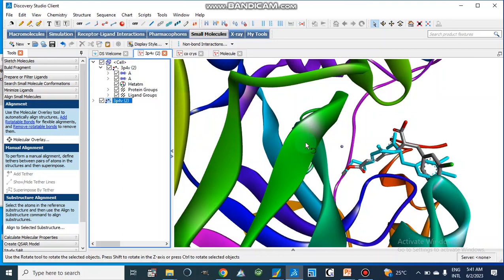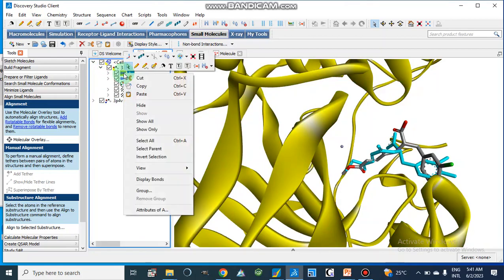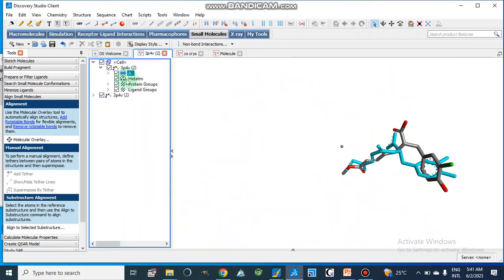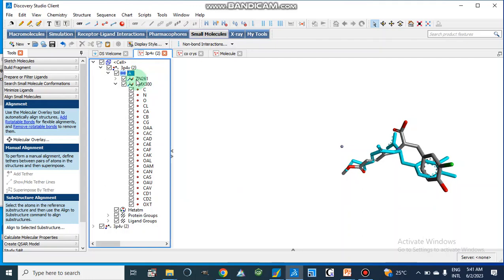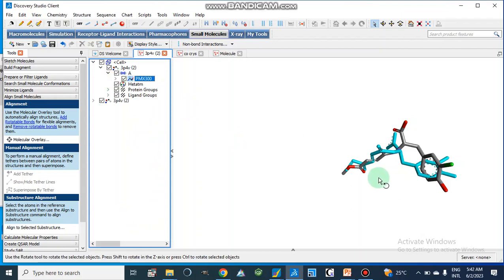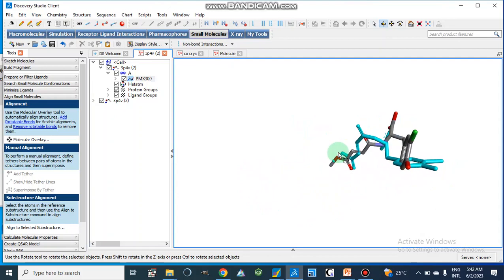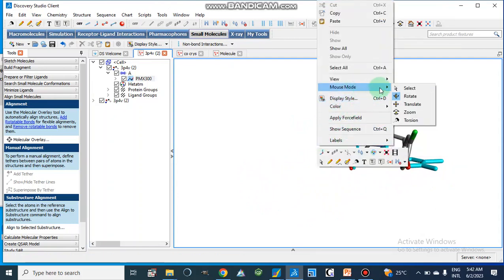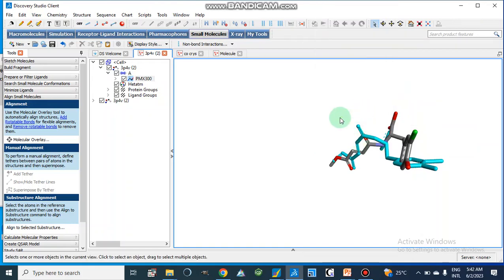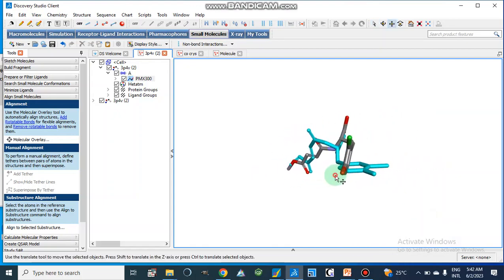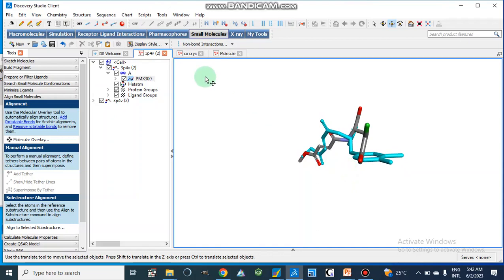After this, we go to this protein and now we are going to remove the protein as well. There is also a zinc atom which I am going to remove. Now these are our two poses. We switch the mouse mode to Translate mode.